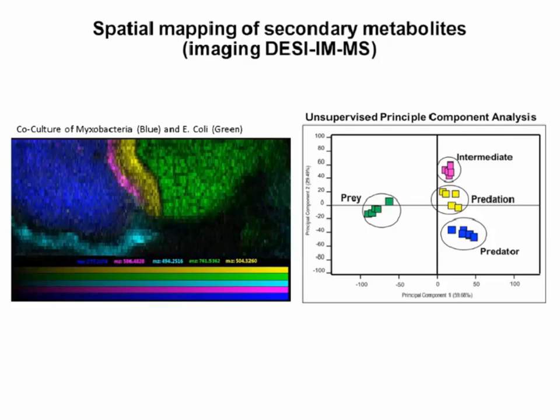Principal component analysis can also be used to reduce the dimensions and determine commonalities between the samples in large sets of data, which is what we did for this particular image. The unsupervised grouping of the regions, represented by their colors within the image, shows the chemical differences between each region. However, this grouping revealed information that was given to us within the spatial dimensions of the image itself.